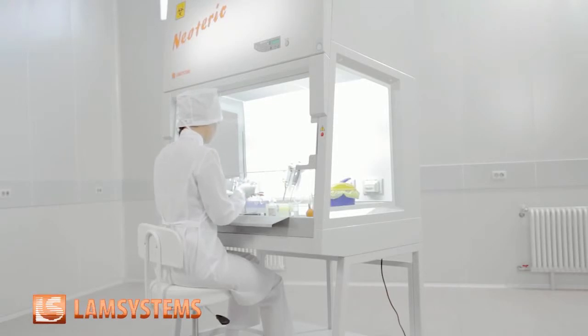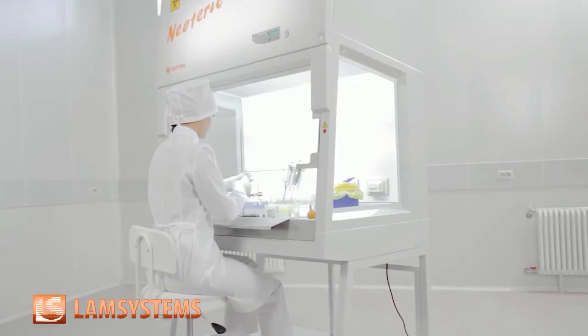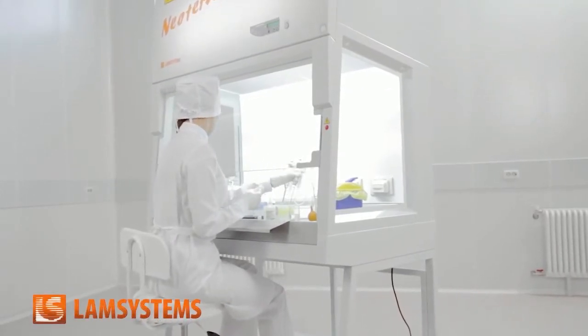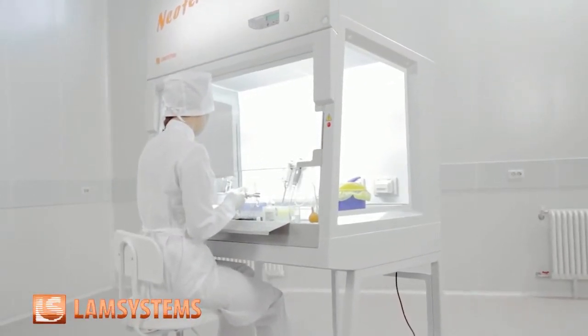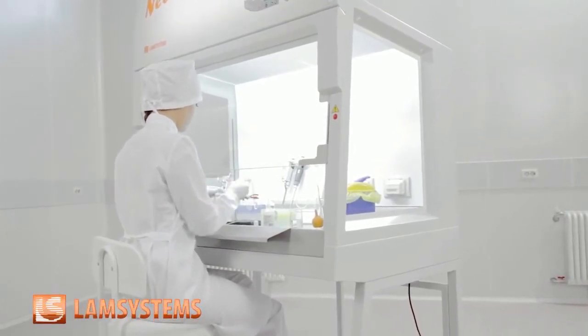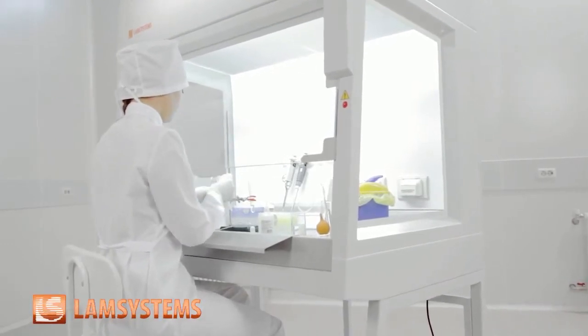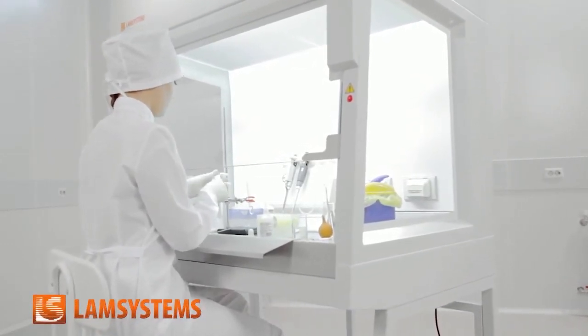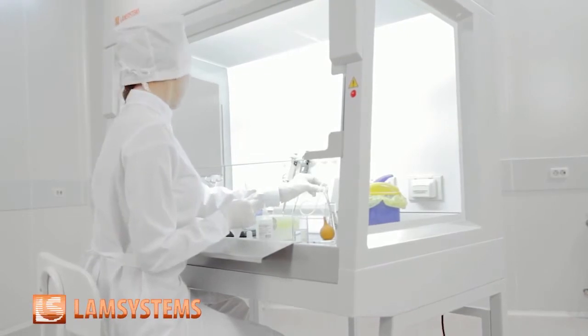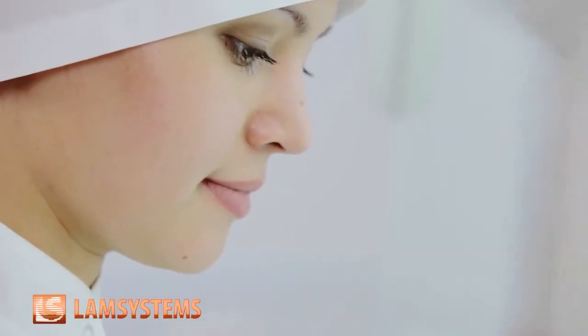Making a new generation of biosafety cabinets, the LAM Systems specialists used all their 15-year experience in designing and manufacturing equipment to create a clean air environment. Everything in the new cabinets — their design, materials, and control system — serves one aim: to make the personnel's activities as secure as possible.